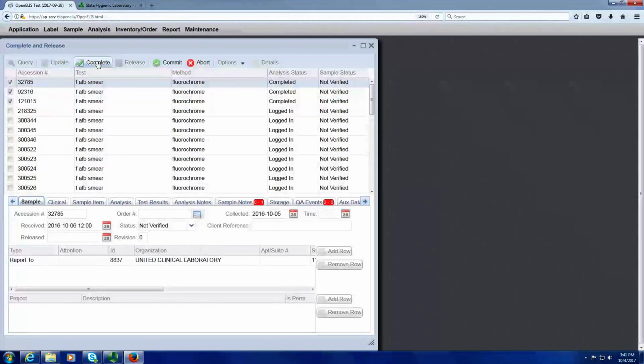Once the Complete button is clicked, OpenELIS attempts to lock the sample record for each of these selected analyses. It will also run any pertinent scriptlets again and refresh the data. Notice that a checkbox is now displayed before every analysis row on the screen. However, only the top 3 analyses are checked with a check mark. This allows me to keep my place so that I do indeed know that only the top 3 analyses are going to be completed upon committal.